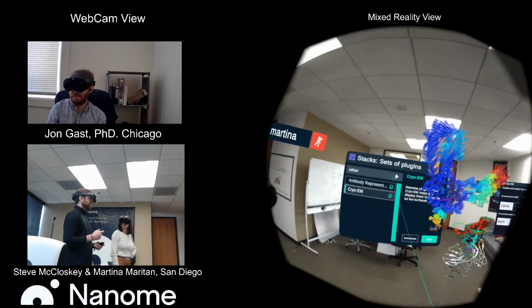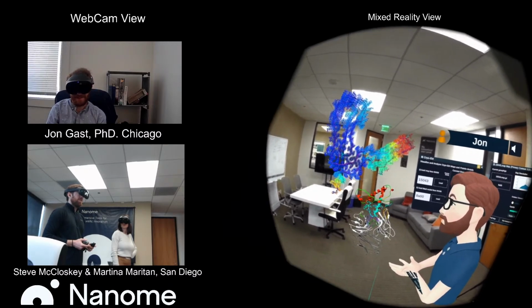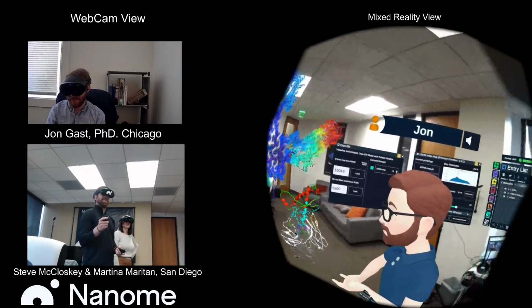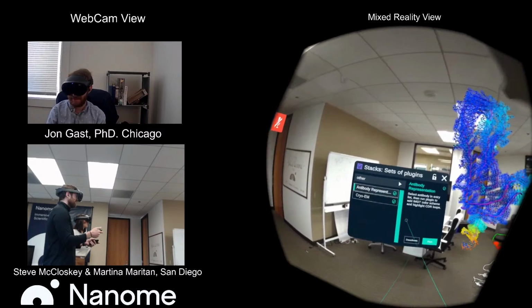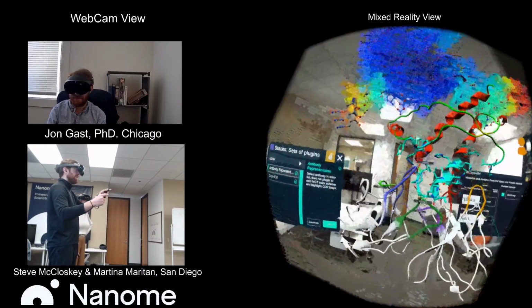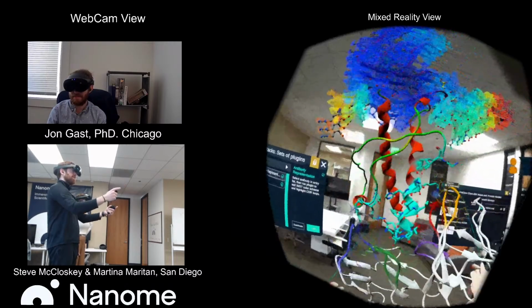On that note, I think that's very related to the next question, which is what other plugins would complement this cryo-EM one? Well, we actually have an example already baked in. John was just alluding to that: the antibody representation plugin. This highlights the CDR loops. It'll go through and find where the CDR loops of your antibody are, and highlight them in various colors so you can see them all together.